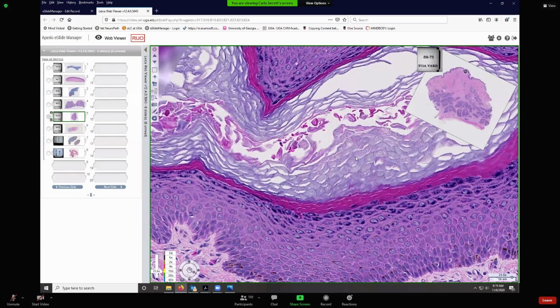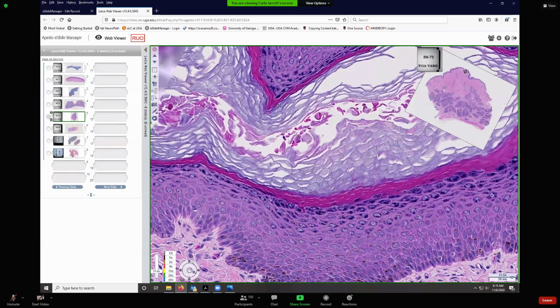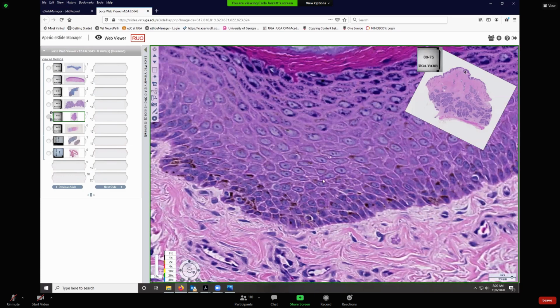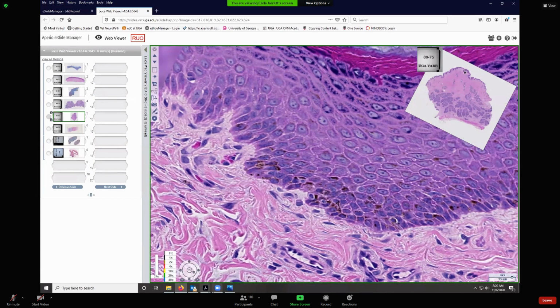And look at that, you can see the little individual squames outlined there, and you can even see the residual melanin pigment that's inside those squames. Okay, so that's all your strata in more detail. We already looked at the non-keratinocytes on the last lab. We chased around on some of them.